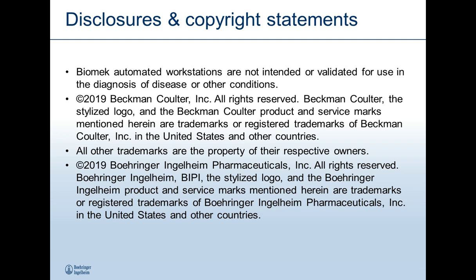And then we'll say within SAMI, as an example of a scheduled environment, setting up an ELISA protocol is also quite simple. The most part comes when optimizing that method for an optimal timing, which is part of what I touched on towards the end of the presentation there.